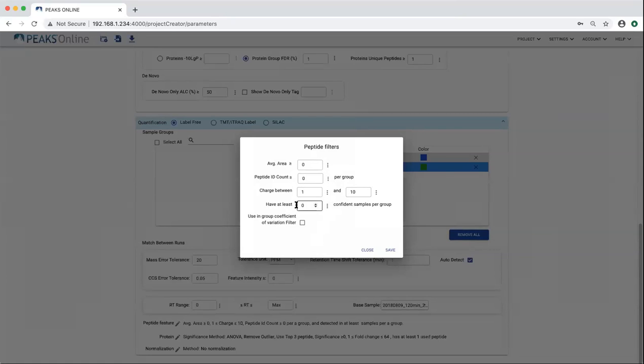And this is saying, I at least want to have X number of MS identifications per group. And so if I'm saying 2, that means that I have to have an MSMS identified from 2 of the 3 runs in each group. And so this can be really filtered up to you, and it's quite quick to change. And that's what I will show you as well.